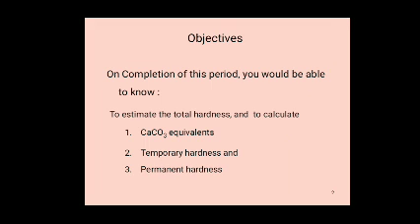is equal to weight of the salt divided by gram molecular weight of salt, into 100. Then you find the hardness of water.